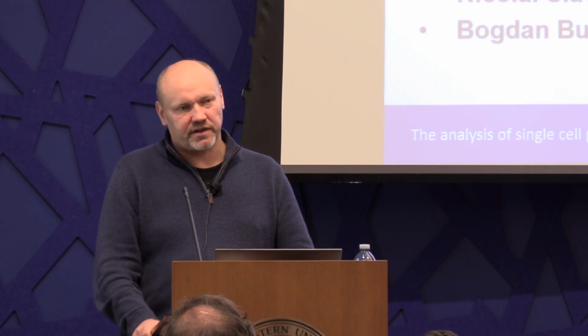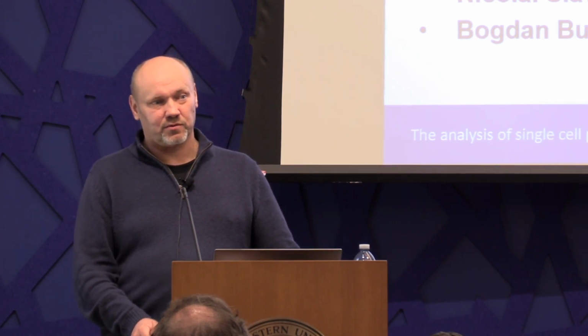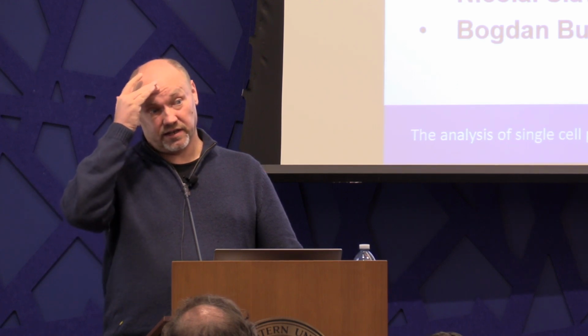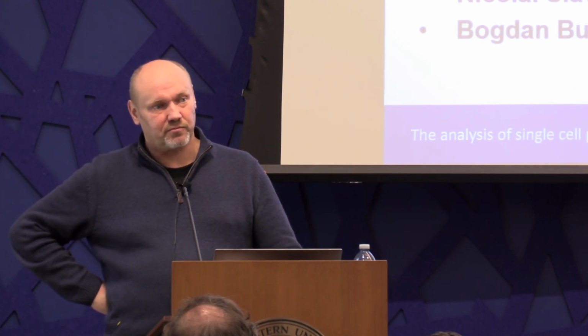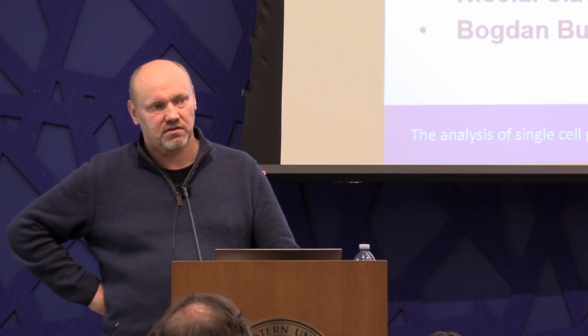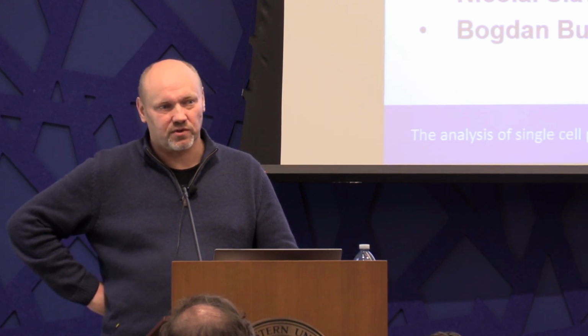Well, we know that it generalizes because we have a test set that has not been seen by the data. If we would do severe overfitting on the data that we have and would only be able to make predictions on the data that has been seen, then the performance should not be as good, because we really use independent data to assess the model. So I'm pretty confident that it's not learning the biases of MaxQuant. It might be learning the biases of tryptic peptides, but not the biases of what we can see with MaxQuant.